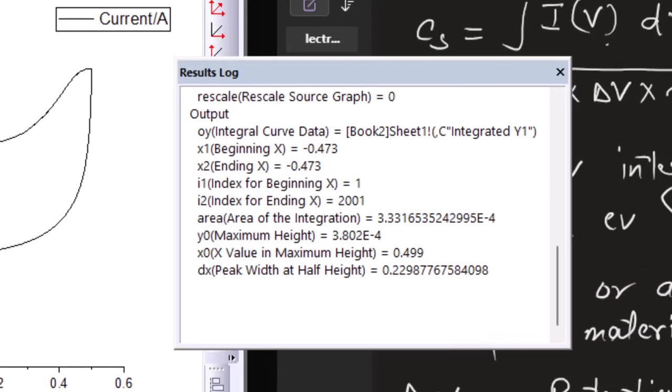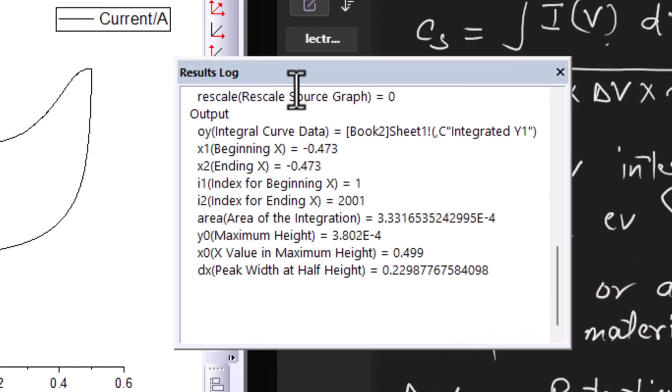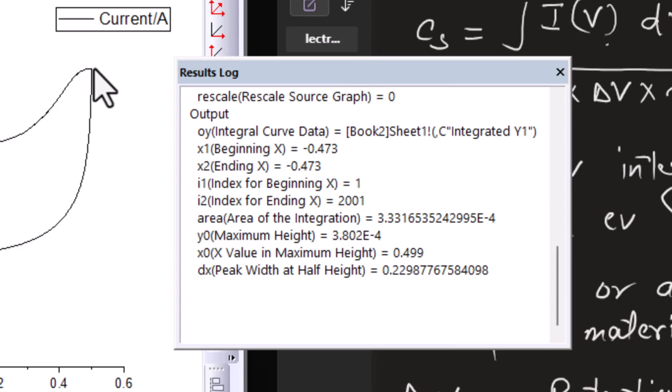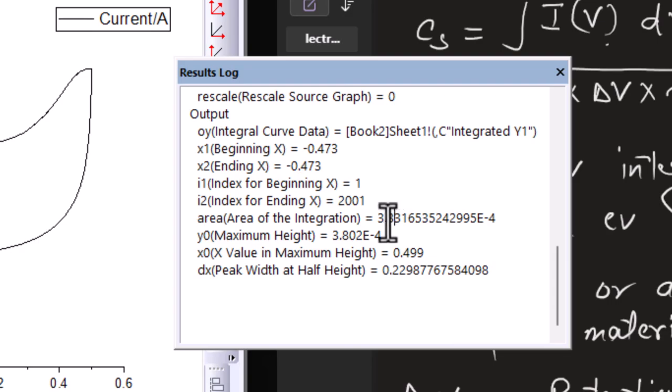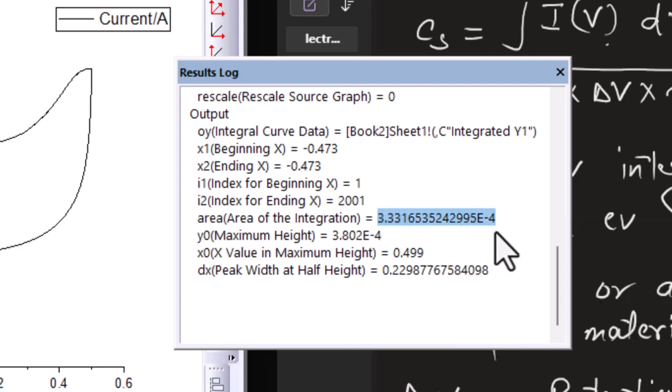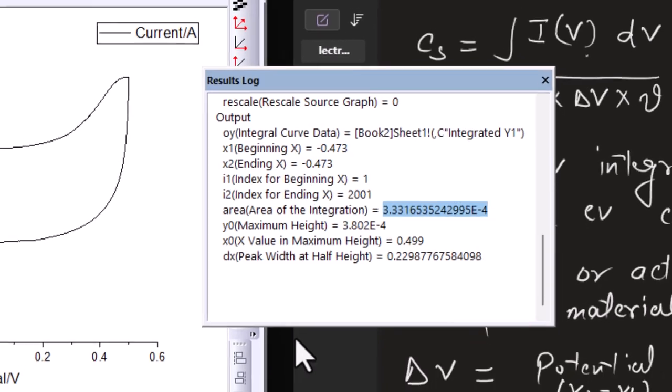Here you need to put this in auto mode and select absolute area. Click here and it will select the window. You have all the information from the curve's starting point to the end, and you have the option for area of integration.